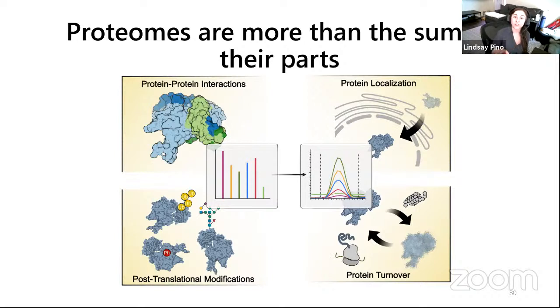Fractionation, as far as physical fractionation, is not recommended for DIA, at least by Brian Searle and I. We recommend gas phase fractionation. So you can go back and listen to his lecture, and he touches more on why we do not do physical fractionation for DIA.